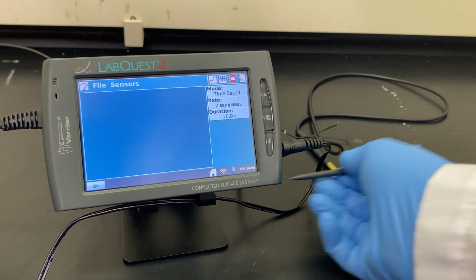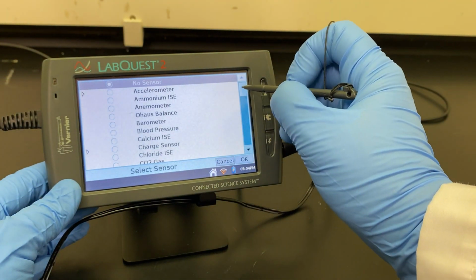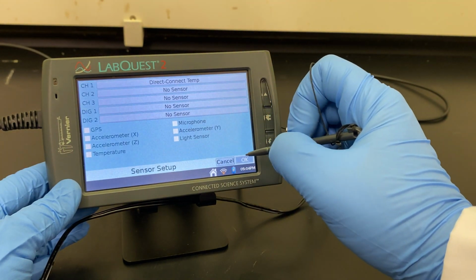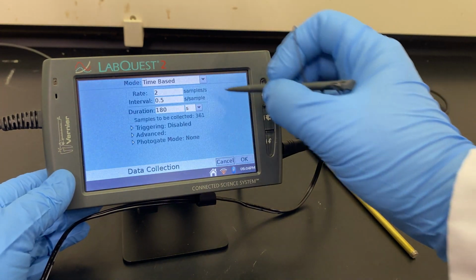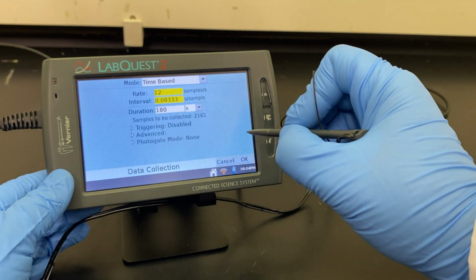Using the stylus, set up the sensor to indicate which type of temperature probe you're using with this device. In this experiment, we're using the Direct Connect temperature probe. Then set up the mode, rate, and duration of the experiment. These values are located in your lab manual.